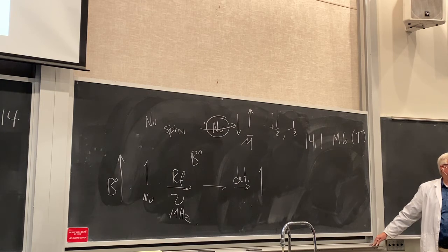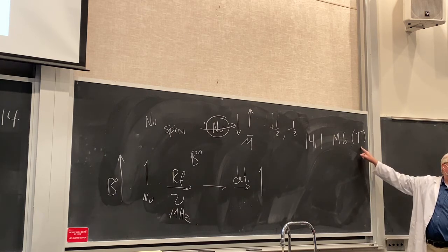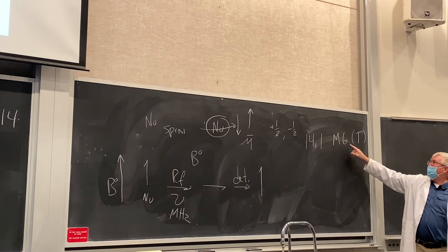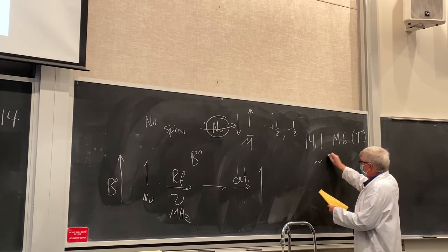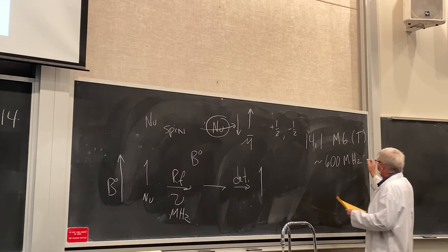Remember the electrical grid competition between Tesla and Edison? Edison had the direct current system. Tesla had the alternating current system. He was into electromagnetic dynamics, which has to do with magnets or Gauss. This is a huge number, mega Gauss, and Tesla was named in his honor. This corresponds to a 600 megahertz machine.